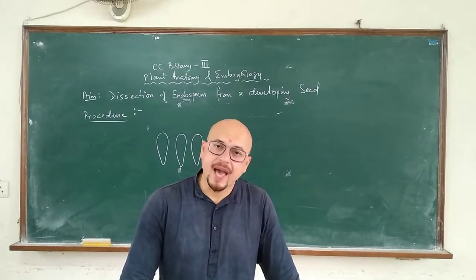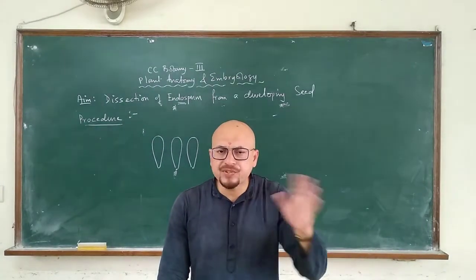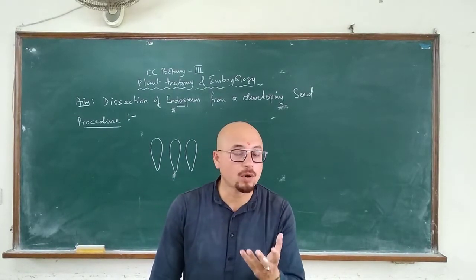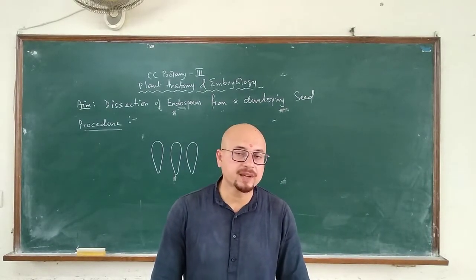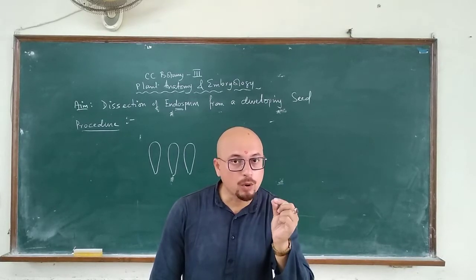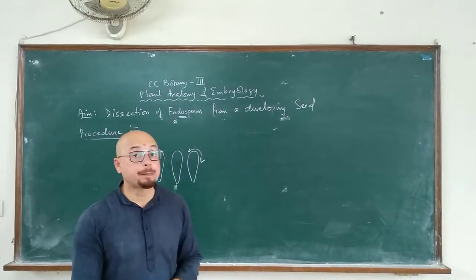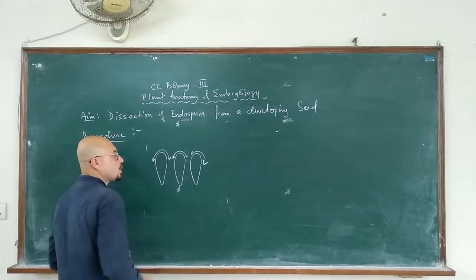It is not necessary to arrange the seeds according to size. But one thing you must keep in mind: the seeds which are absolutely translucent, don't use those seeds. Rather, seeds which are opaque in nature — you can very easily distinguish them once you put all the seeds in water in the petri plate. Those opaque seeds would give you better results. They are much easier to handle. You can press them, hold them properly, and then with a blade, you put a slit on the blunt end. Do not put a slit on the pointed end — always put the slit on the blunt end with the blade.